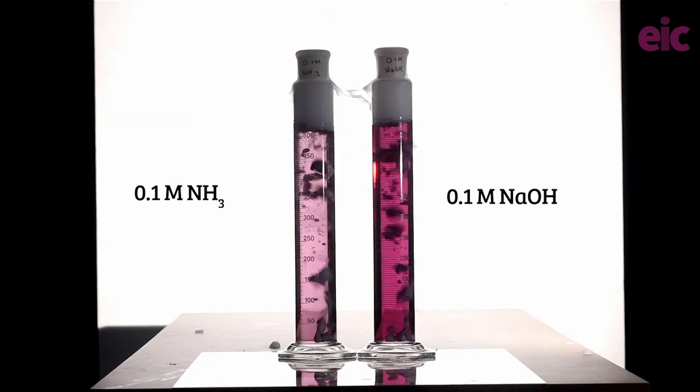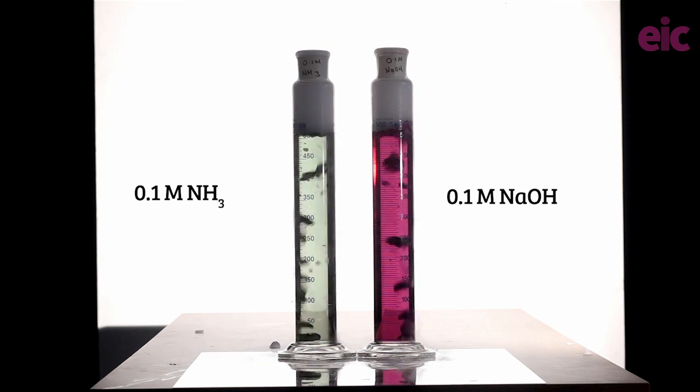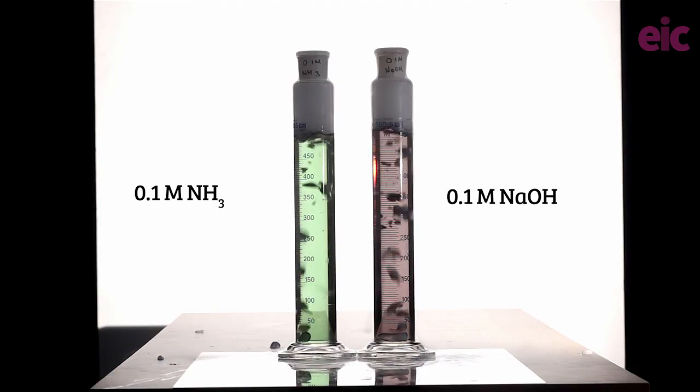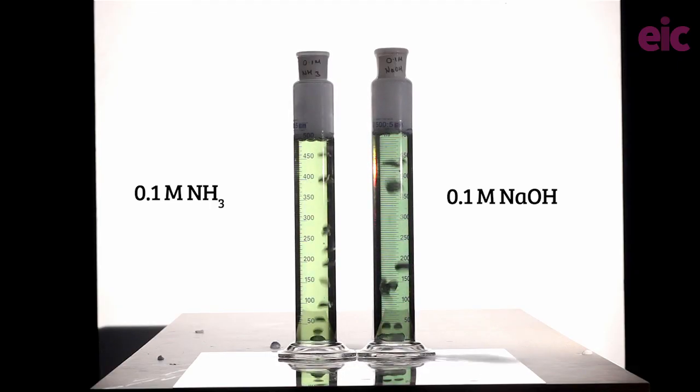What do you think would happen if I were to make up my solutions more carefully? Let's take a look at some samples of 0.1 molar sodium hydroxide and 0.1 molar ammonia. Which do you think will change colour first, and why? Will they both go green at the same time? When will the last colour change take place?